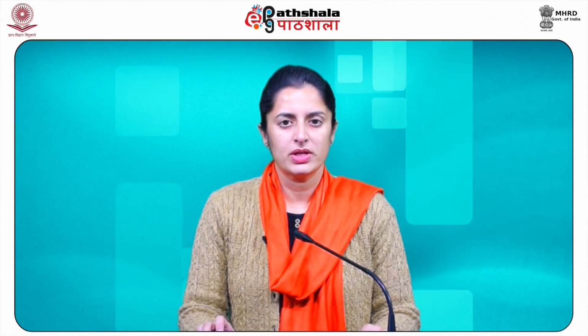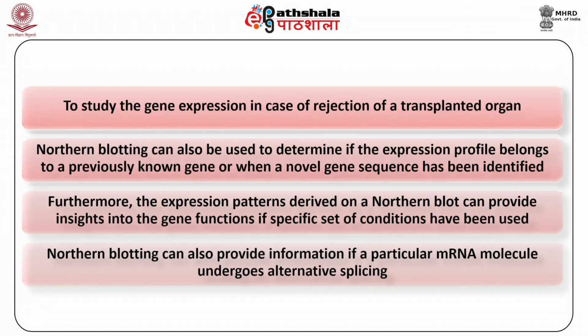The technique has been applied to demonstrate overexpression of several oncogenes and downregulation of tumor suppressor genes in case of cancer as compared to the normal cells. It has also been applied to study the gene expression in case of rejection of a transplanted organ.